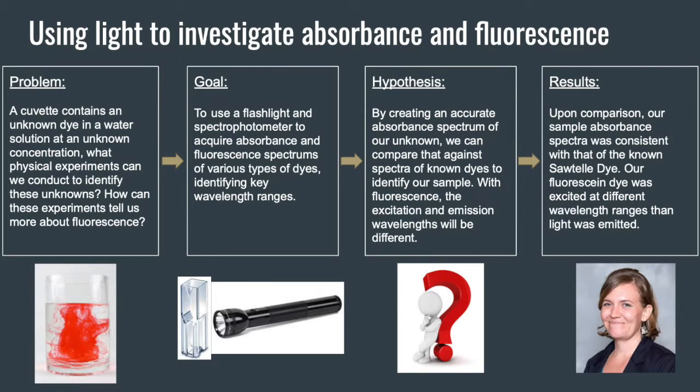The main problem in this experiment is that a cuvette contains an unknown dye in water solution at an unknown concentration, and what physical experiments can we conduct to identify these unknowns? In addition, how can these experiments tell us more about fluorescence?